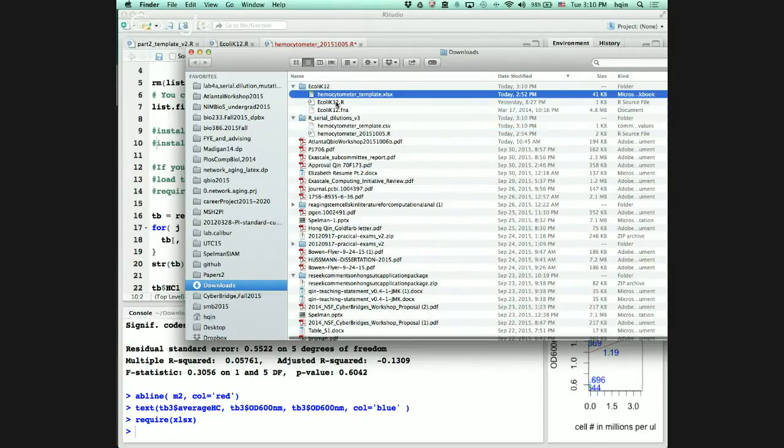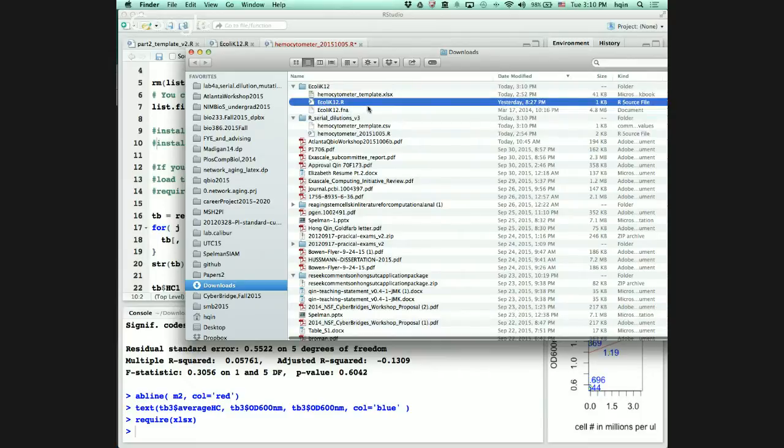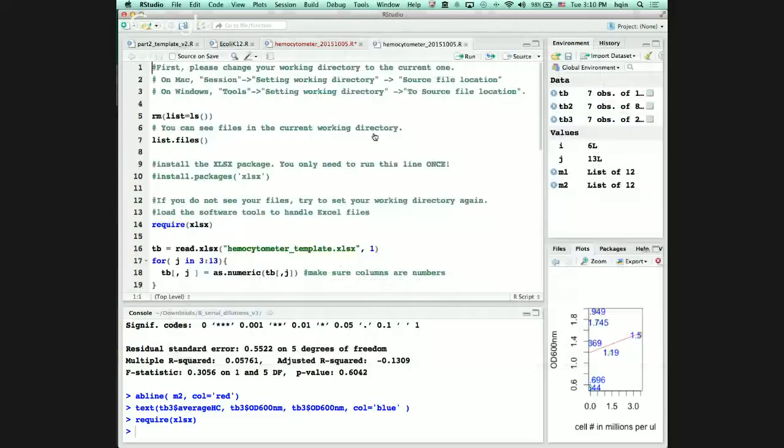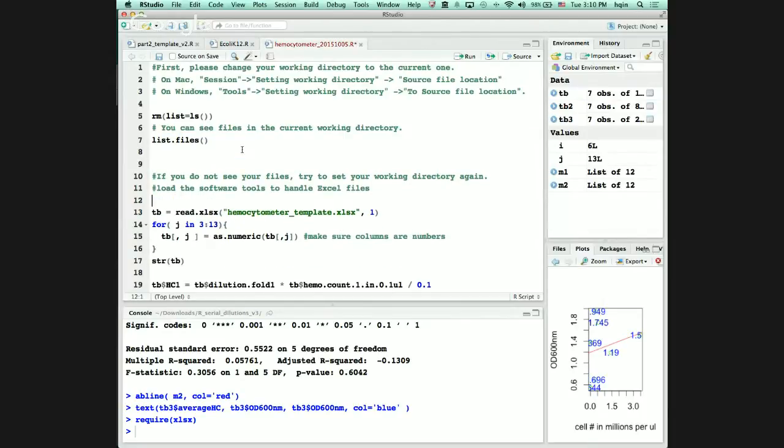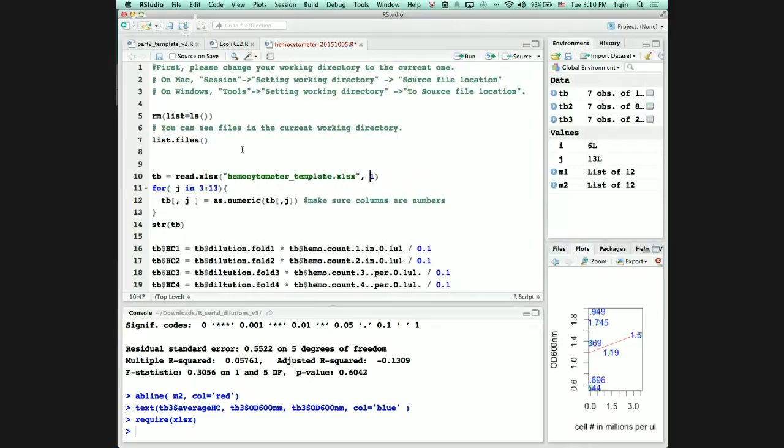Every year when I run this with many computers, there's always one or two computers that come out with something surprising. Oops, I did the wrong thing. Sorry. But this time it should at least make things a little easier. We don't need to install the Excel package anymore. All we need to do now is just read the CSV file.